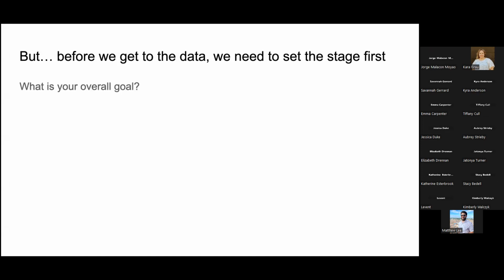So if you were to come to my lab and you had a particular interest in performing a drug screen, these are the types of questions that we would talk through. So I'd want to know what your overall goal is. I would want to know what your target is. But here, this is a trick question that I tend to ask every once in a while. But I'll describe why this is a trick question later on.